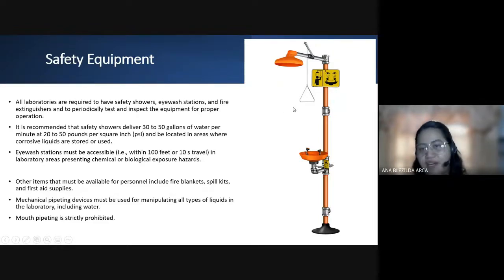natapunan ka ng chemical sa lab gown mo or sa katawan mo, tapos nasusunog na yung balat mo, 'di ba? Ang first aid mo dapat gawin is to remove the clothing, tanggalin mo yung damit mo na may mga asido, and then takbo ka na dito sa shower. Kailangan class kasi mawala agad-agad yung chemical sa katawan mo. Okay? Kasi kapag nagtagal pa yon, yung mga burns na yan, lalalim. Magiging third degree burn yan. Okay? So, ganun dapat.